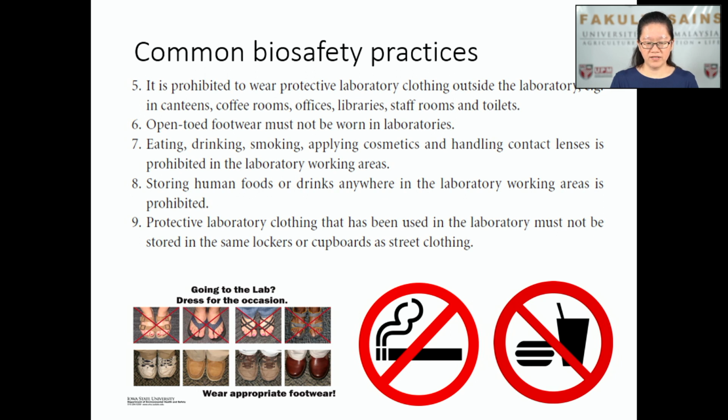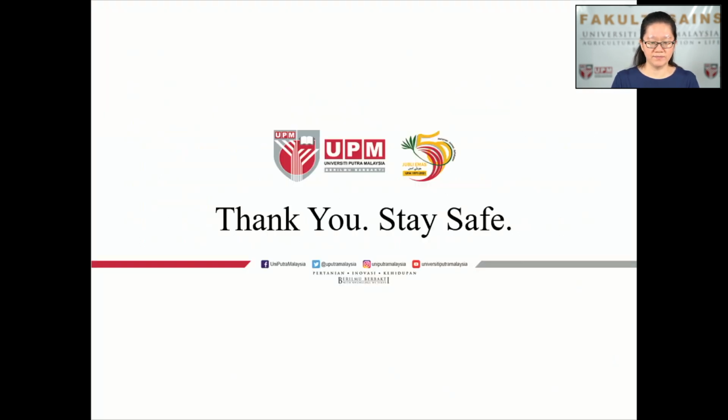And last but not least, protective laboratory clothing used in the lab must not be stored in the same locker or cupboard as street clothing. With these simple biosafety practices, it is hoped that everyone would do their part to make the laboratory a safe place to work in, to minimize accidental exposure to harmful biohazards.